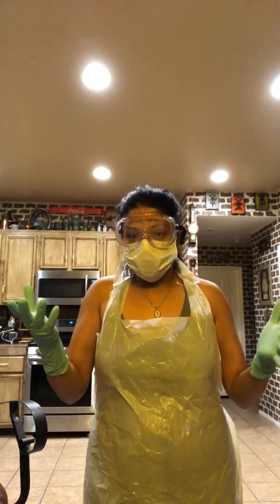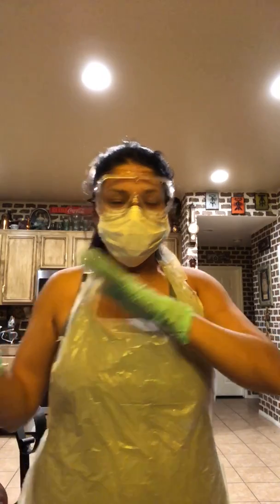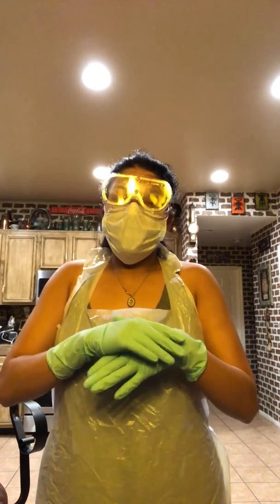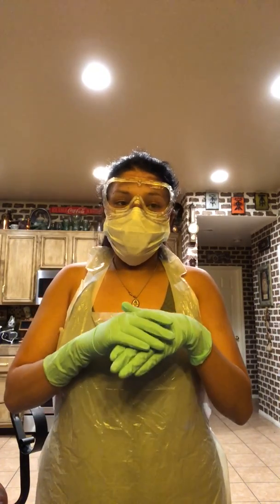First, of course, I had my gloves, my apron, my mask, and my safety goggles. I wiped off my work area with 10% bleach. I also had undiluted bleach on the side in my red bucket, which I will be showing you guys if I find it. I also had my half cup of alcohol.